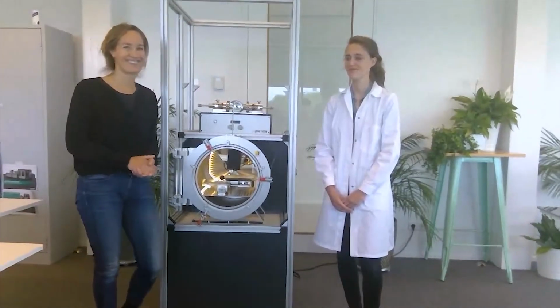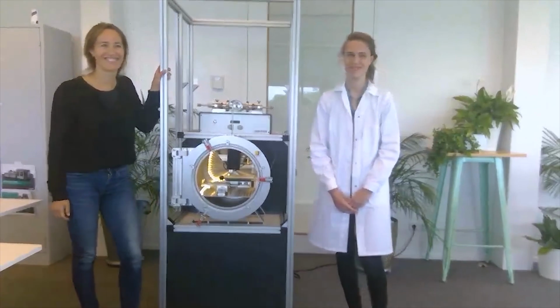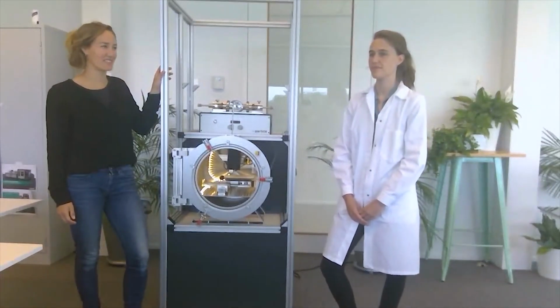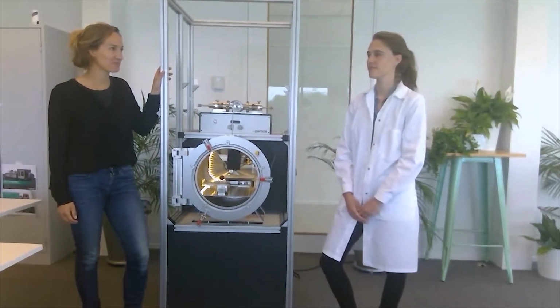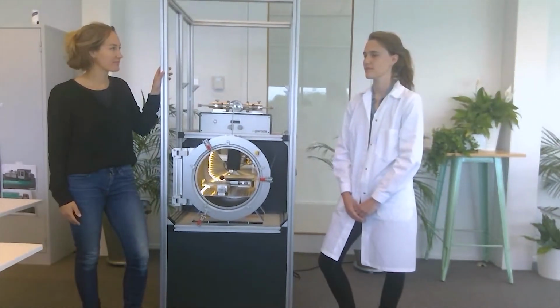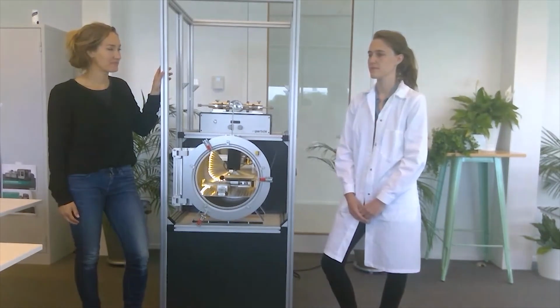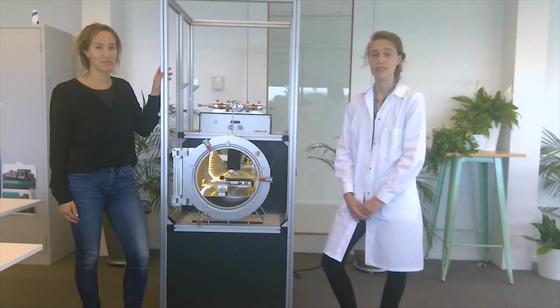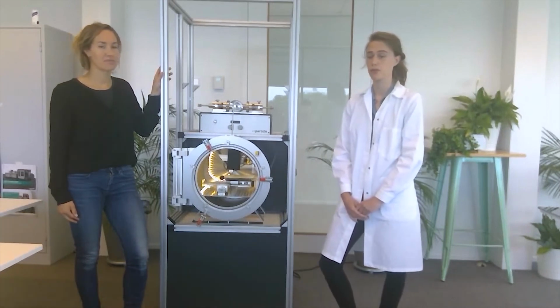For the electrodes, can we use in-house fabricated custom alloy? Yes, as long as they are conductive, then that should be possible.